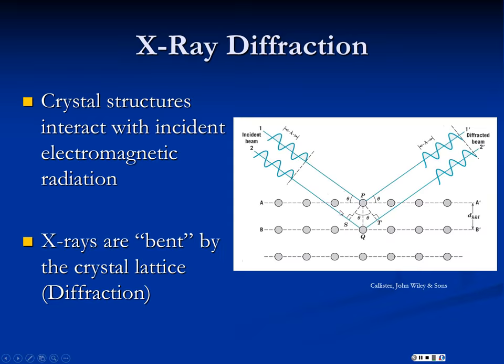Now, you've seen this if you've been fishing and you notice that your fishing line comes off of your pole at a certain angle, and it appears to be bent at the water, and that's caused by the light being diffracted as it passes the interface of the water, and so it doesn't come to your eye aligned with its original source. So this diffraction occurs at any interface where there's significant interaction, and it can happen in visible light as well as X-rays. But for metals and crystalline materials, the crystals interact by diffracting X-rays in particular.